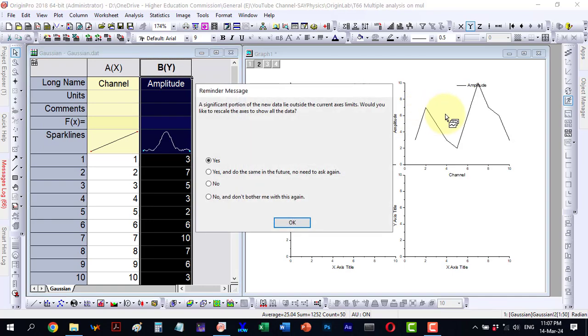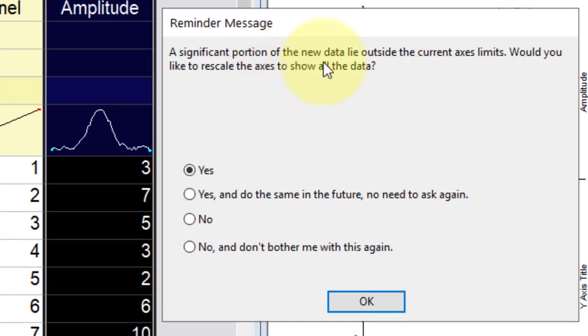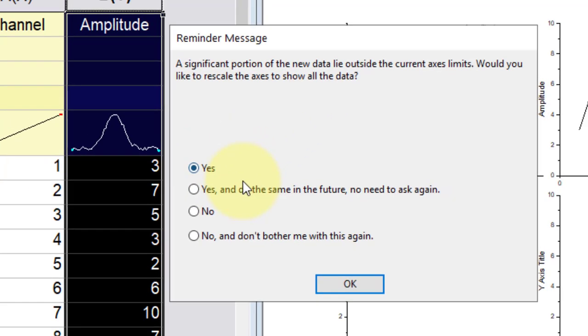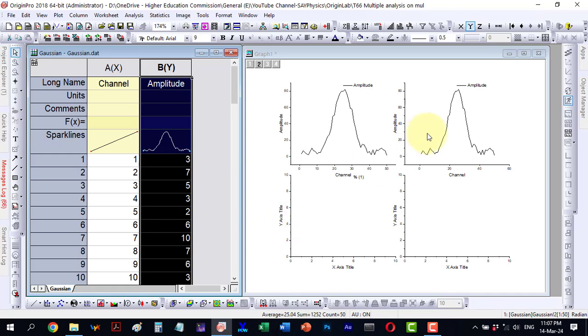A notification appears indicating that a portion of it lies outside the current axis limit. Would you like to rescale it? Yes, I opt to rescale it. Clicking OK, the same data now appears here, essentially replicating the original.